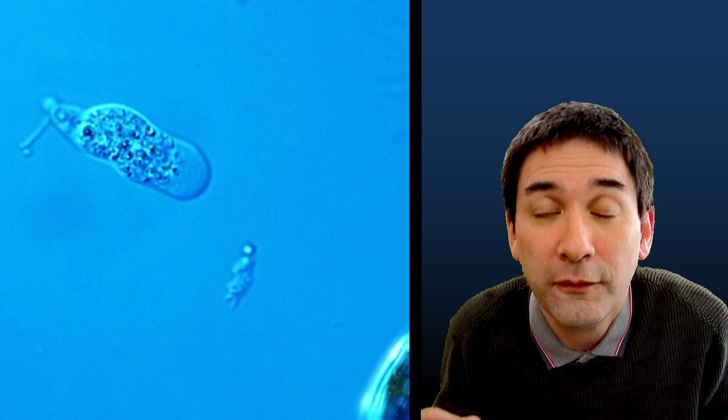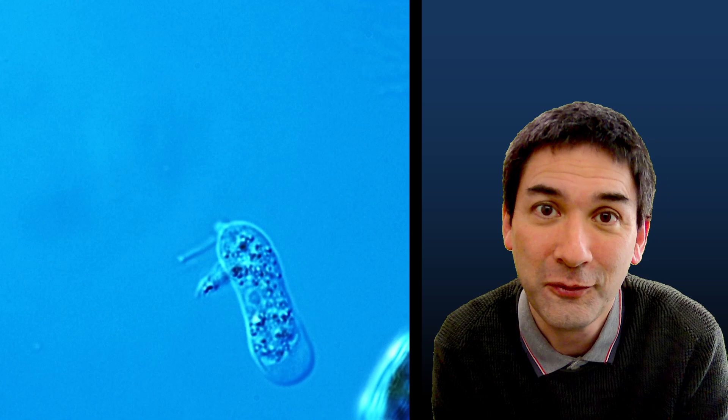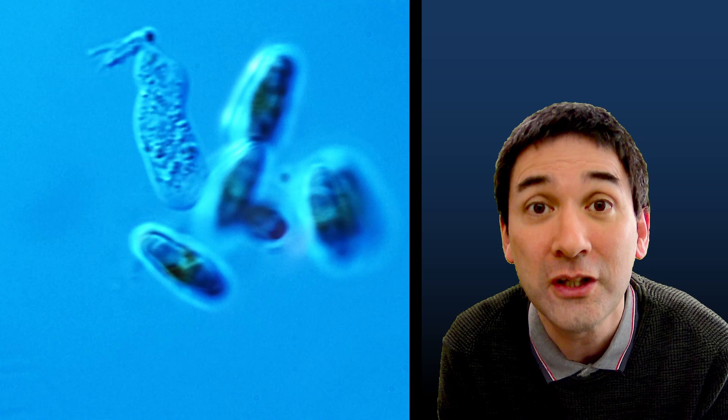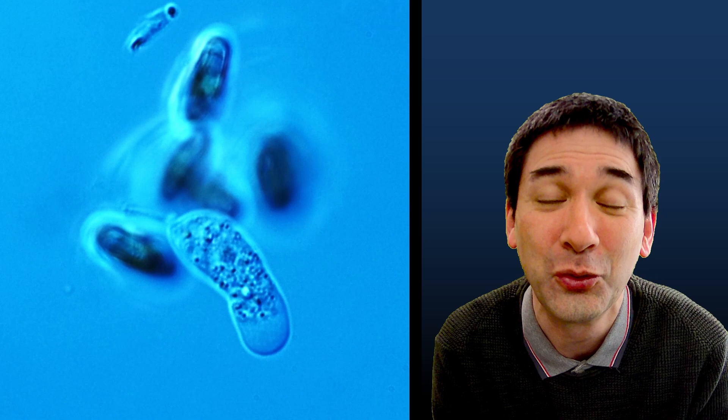Now, those amoeba are heterotrophs. This means they have to feed on organic material. But where does the organic material come from? Well, you've guessed, as I told you already, the algae, the single-celled algae, they produce them. So they are the basis for the food chain. And so we see that essentially we have already a little ecosystem or at least a small community of microorganisms inside the coffee machine.